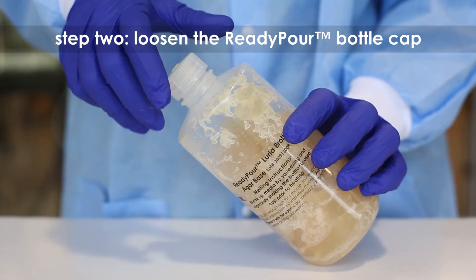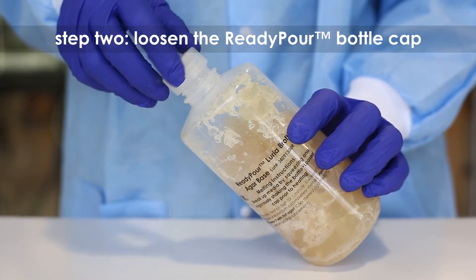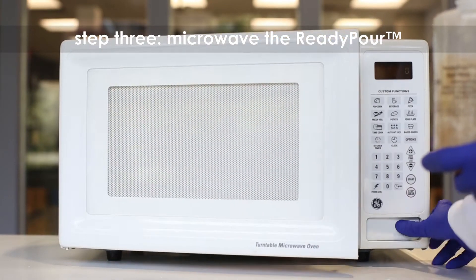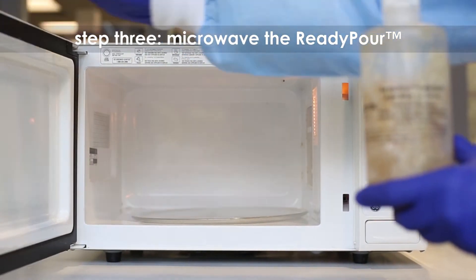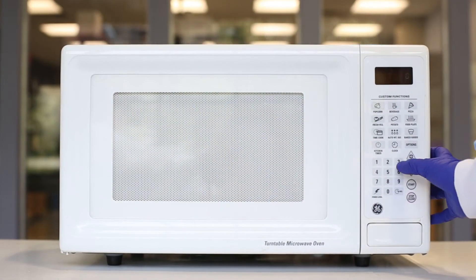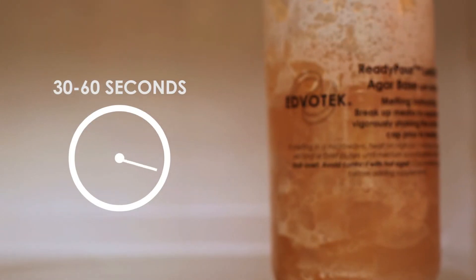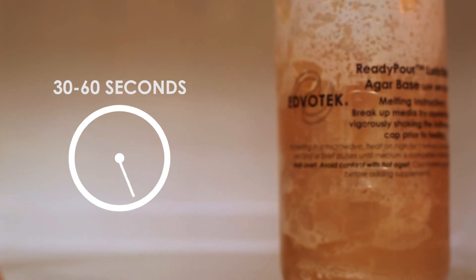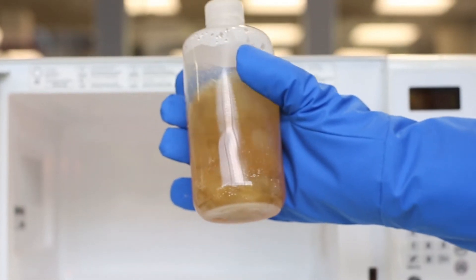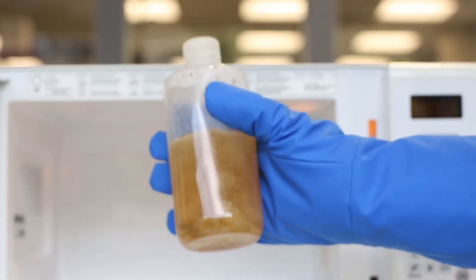Step 2: Loosen but do not remove the cap on the ready-pour bottle. This allows the steam to vent during heating. Step 3: Microwave the ready-pour agar on high for 30 to 60 seconds to start the melting process. Carefully remove the bottle from the microwave and mix by swirling.